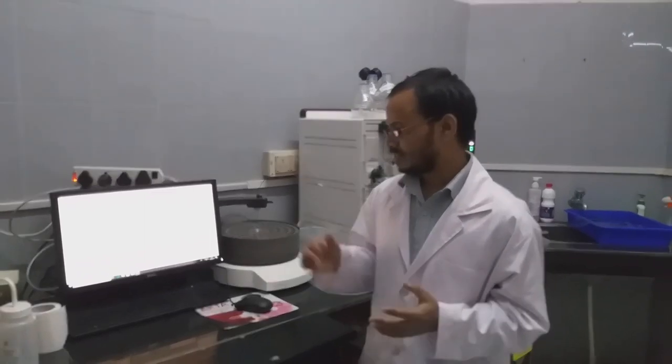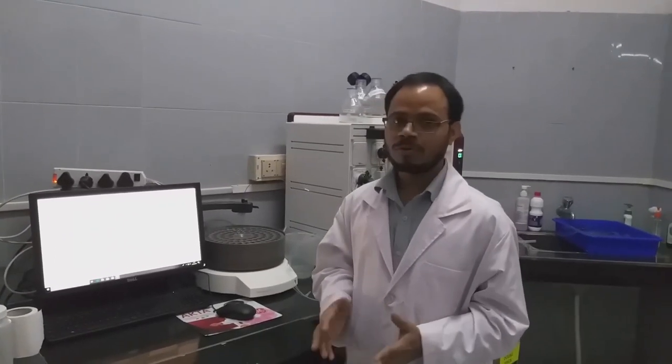So this is all about gel filtration chromatography. We will show you how to analyze the result.